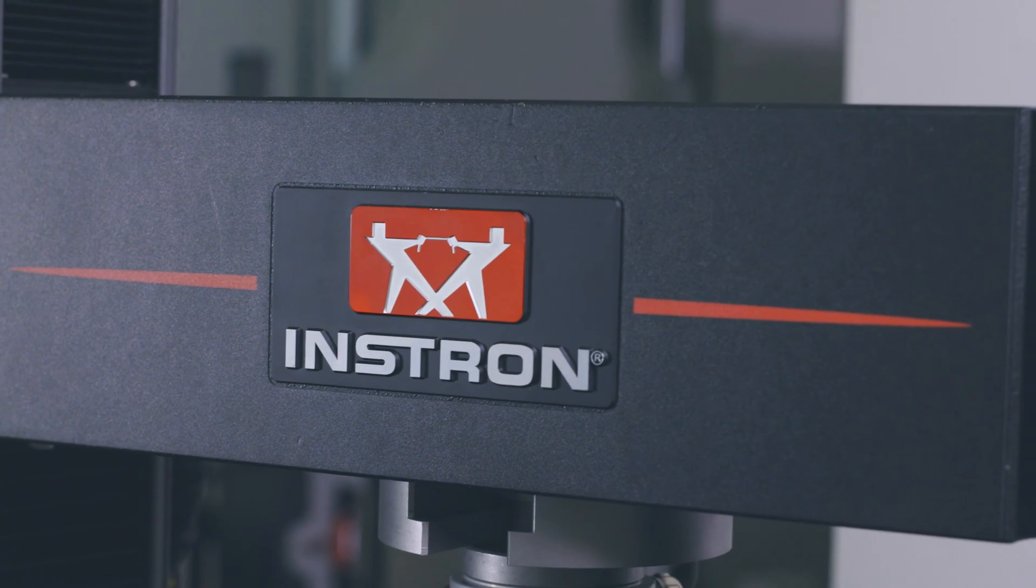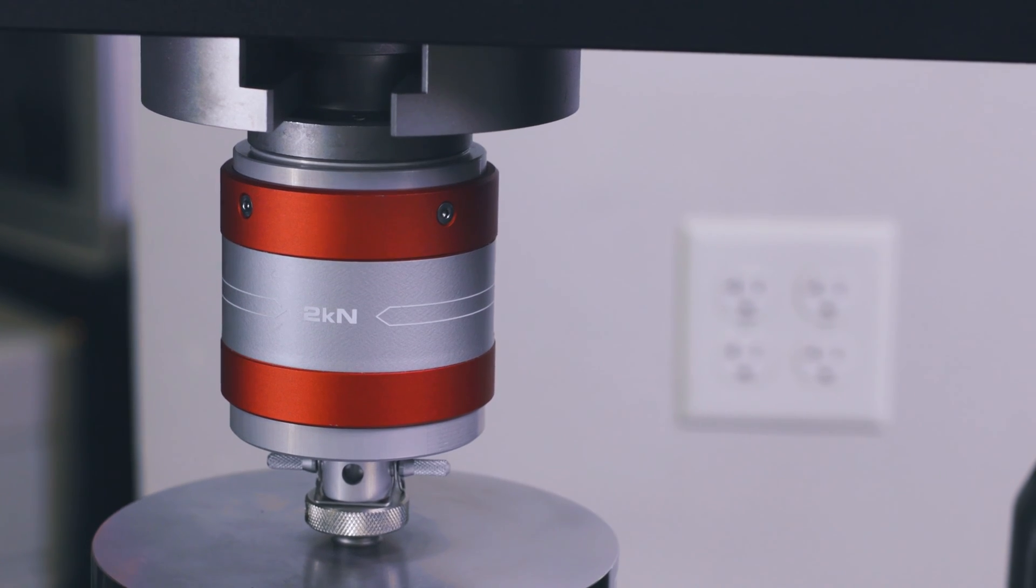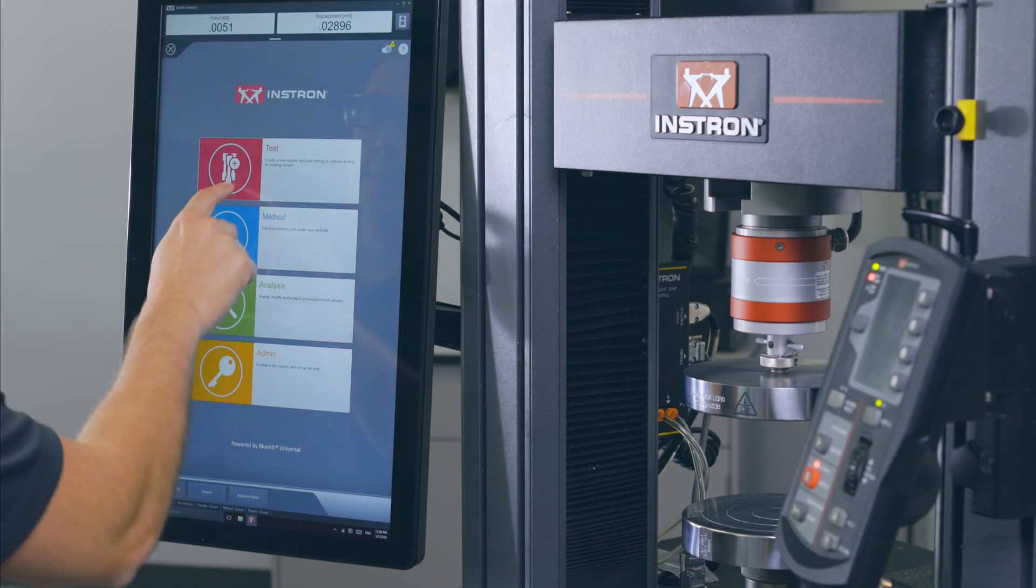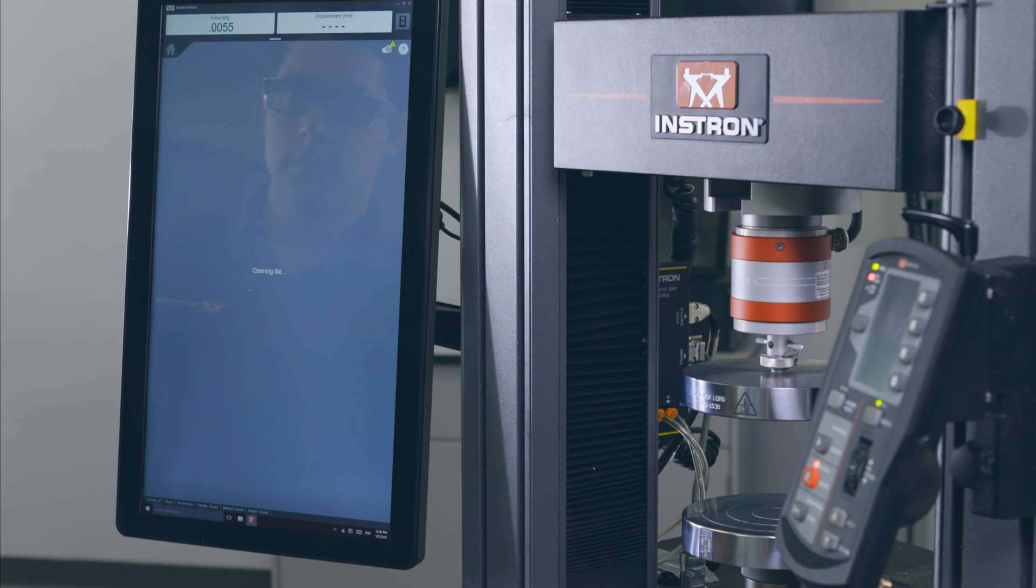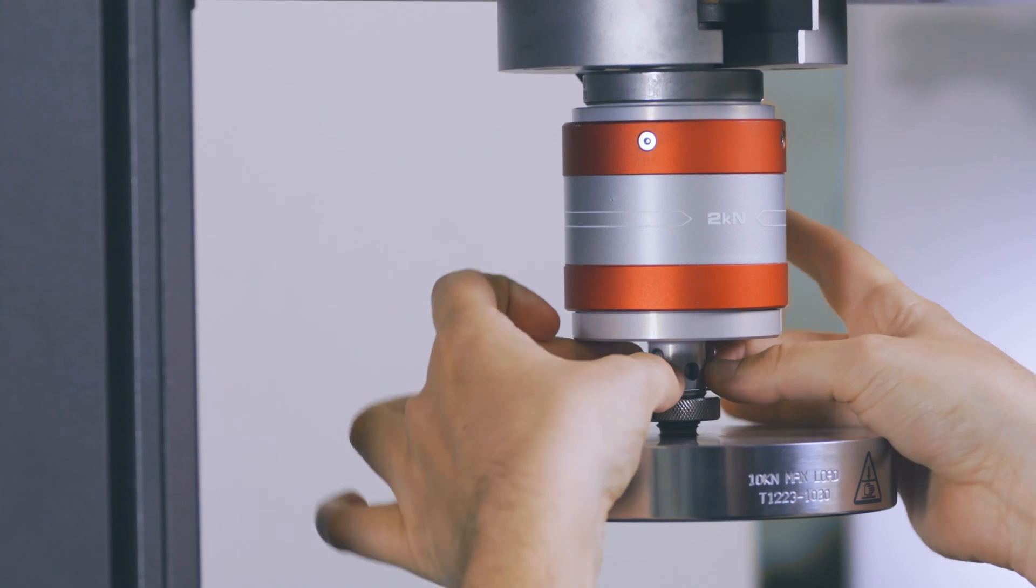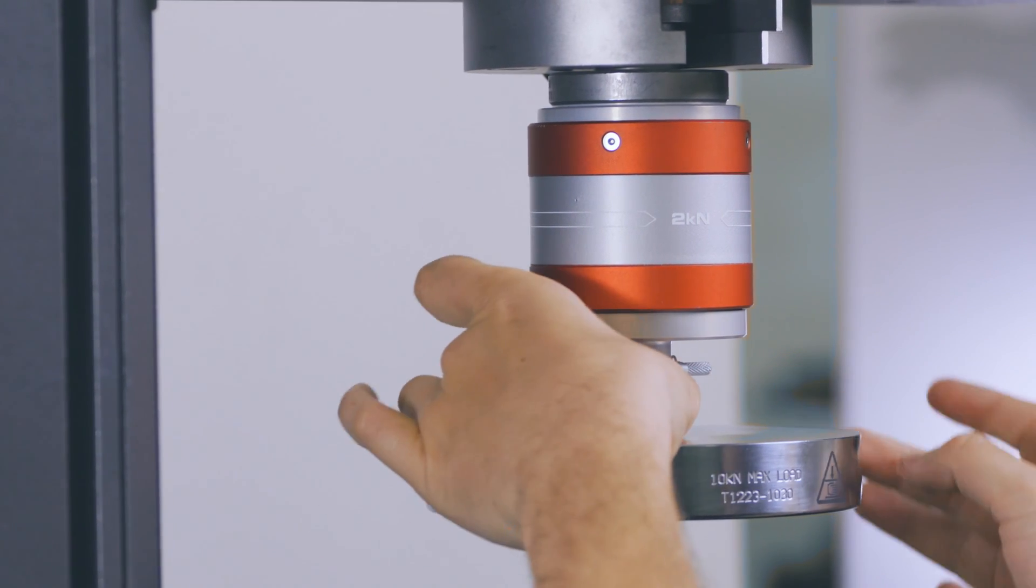The crosshead is the moving component of the system, which can move up or down depending on the test type. Load cells of various capacities can be attached to the underside of the crosshead. The Blue Hill software controls the motion of the crosshead and is used to develop and run test methods. This is a modular system with hundreds of grips and fixtures that can be attached to the machine with a simple pin and clevis connection.